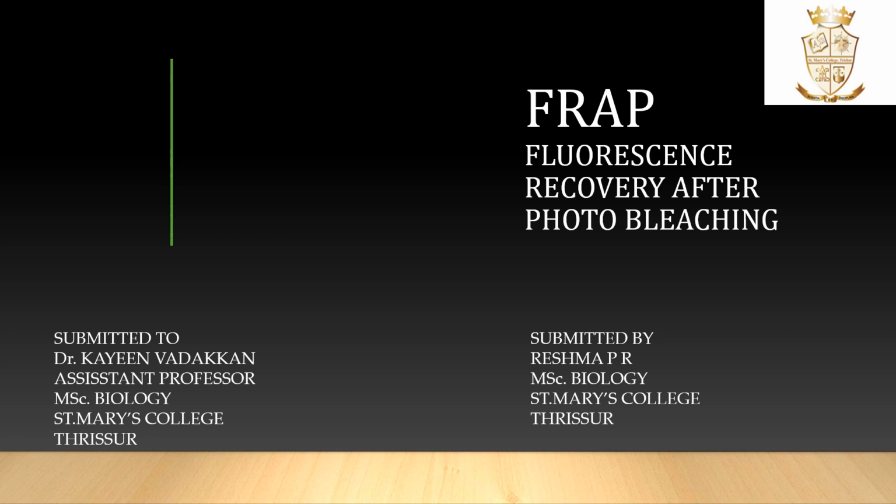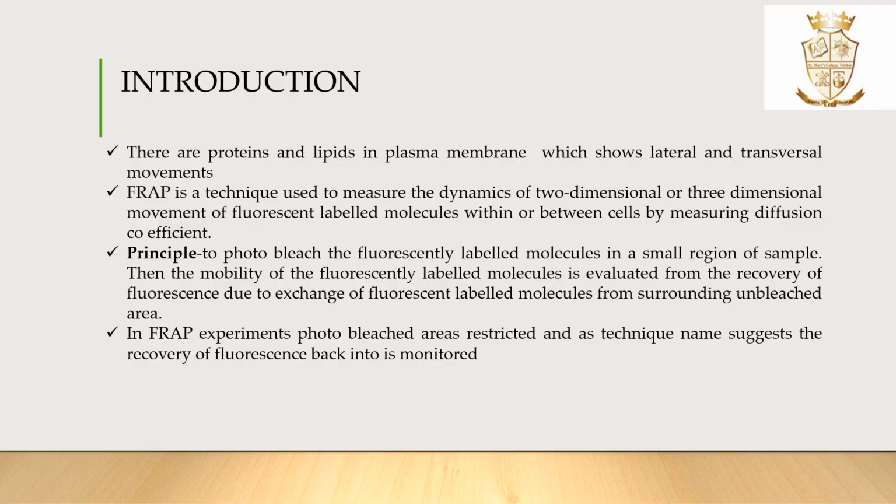I'm going to discuss the topic FRAP, fluorescent recovery after photobleaching. When we come to the introduction, we all know there are proteins and lipids present in the plasma membrane of all living organisms, which show lateral and transversal movements.